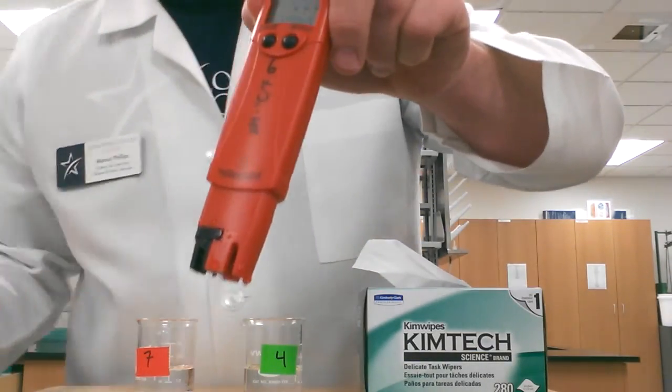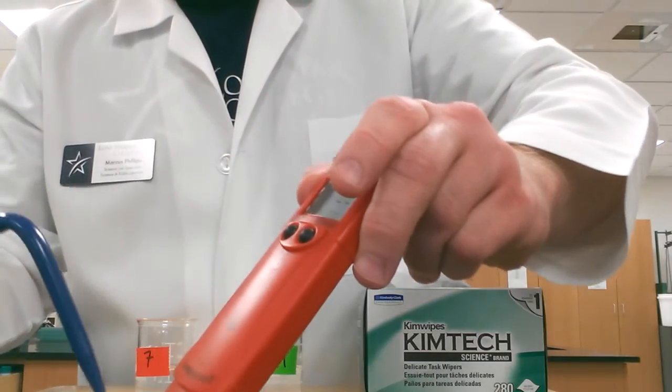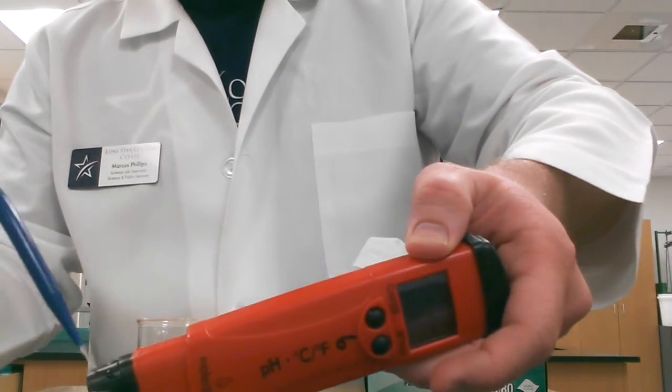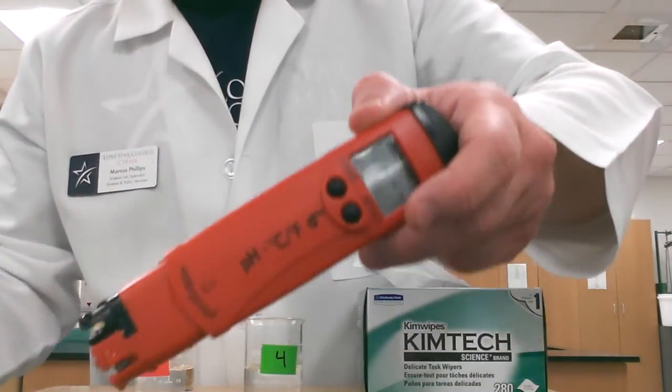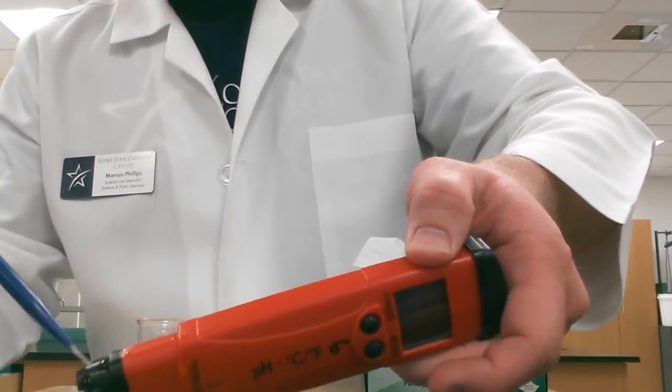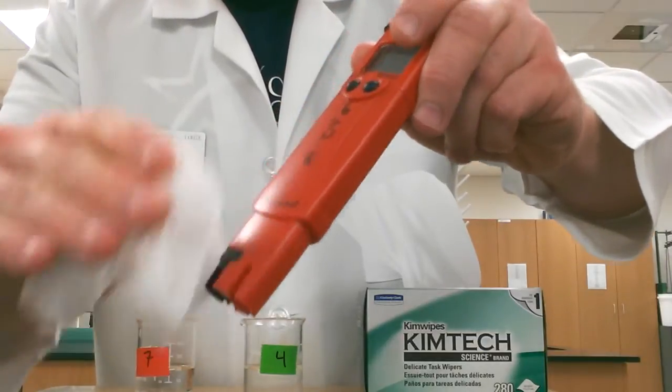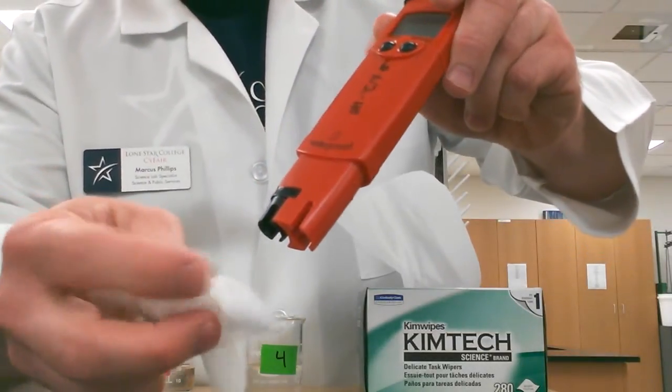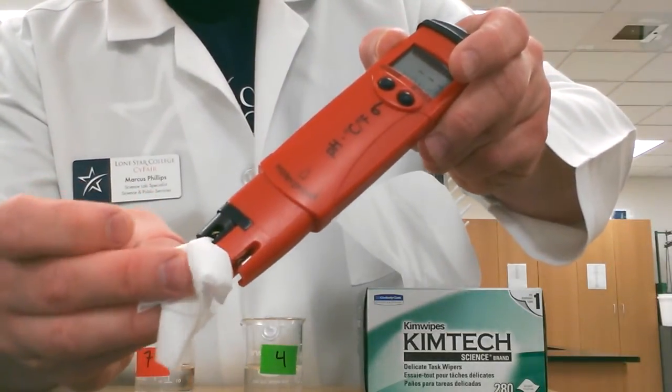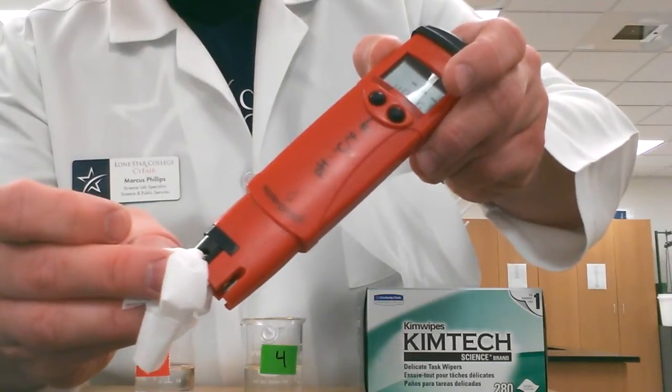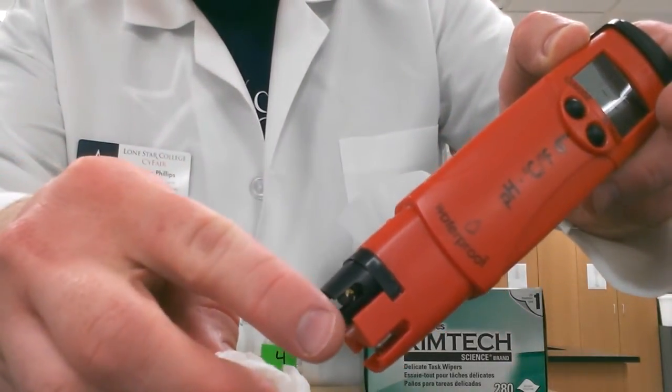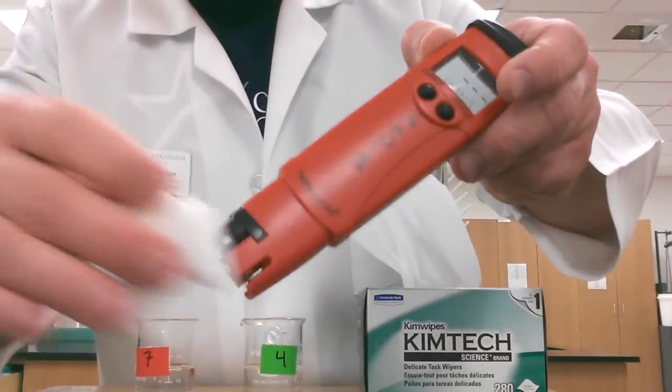We're going to rinse our electrode with the DI water all around it. So once we've got that nice and rinsed off, we can dry it with our Kim wipe and gently tap the small bulb that's here, that's the actual electrode. Get that nice and dry.